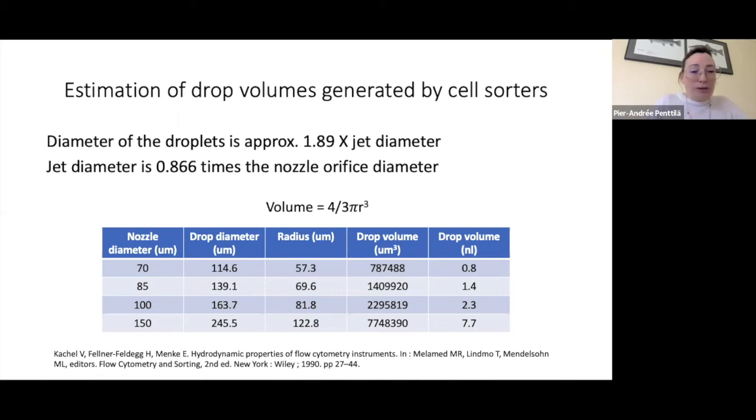For many people, this is particularly important for anyone trying to purify or fractionate populations of a very large number. There are occasions where they want to make sure that they minimize the amount of saline or buffer in the solution, in particular for anyone doing downstream genomic applications or single cell genomic cell sorts, where they are particularly concerned with a very low droplet volume in nanoliters.